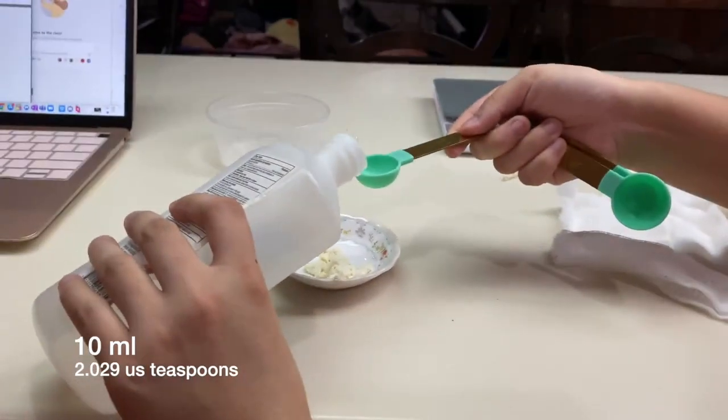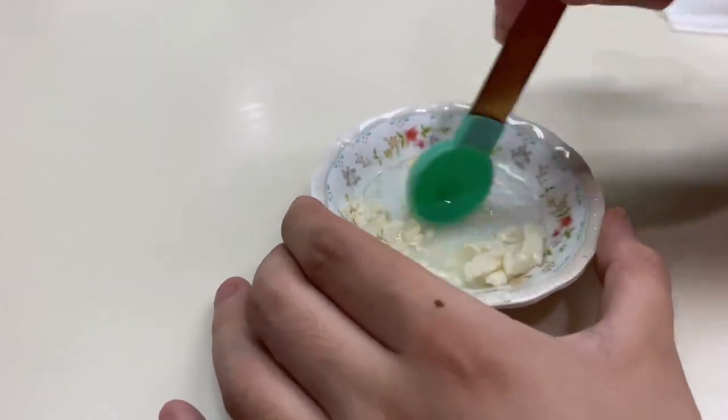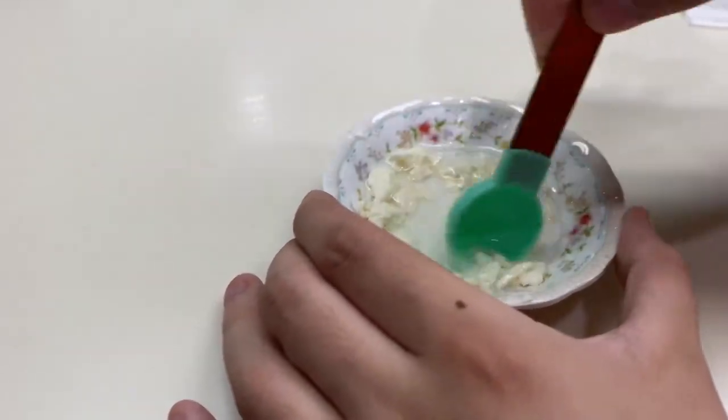After stirring the mixture for 5 minutes, filter again using cheesecloth, squeezing the cloth gently to remove excess ethanol. The liquid filtrate contains fats and must be discarded.